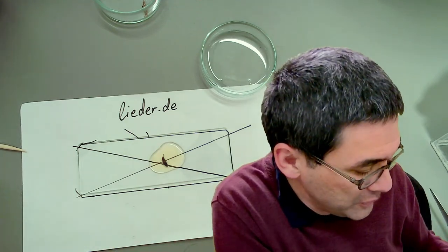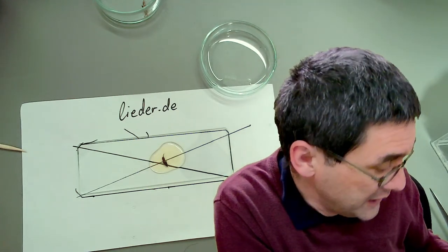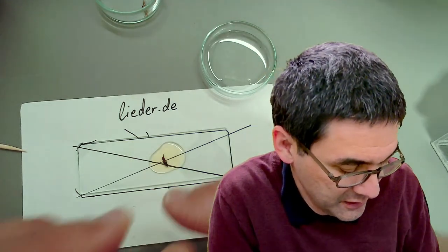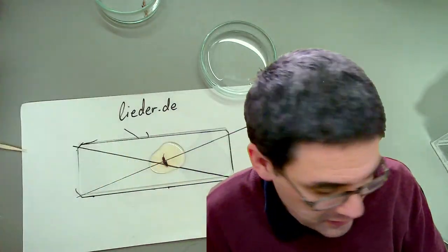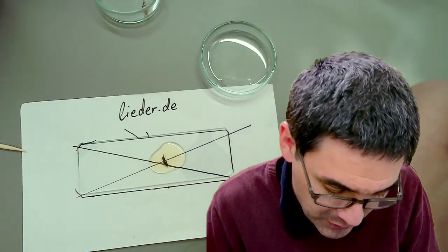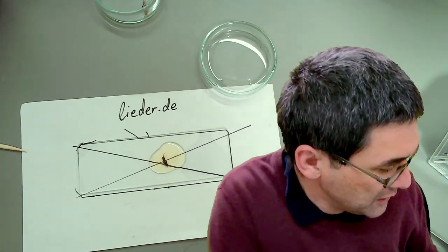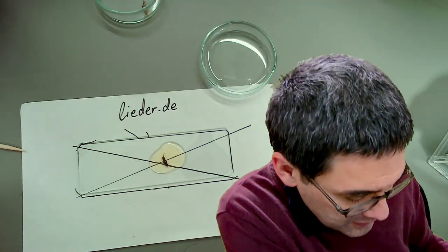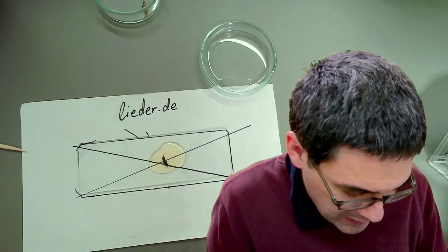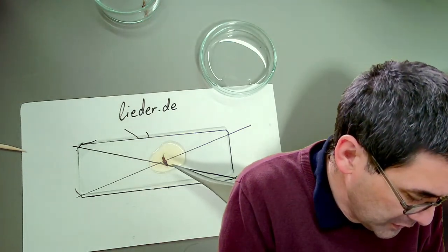This one is way too much mounting medium. It's going to run out on the side, right? Because it's 1.5 hours. Cannot believe it. I don't want to use this. There's a little edge missing here. And if I use a cover glass, then it should be nice. Because otherwise, why use one? Okay. So let me clean it again. And there is going to be lots of mounting medium running out.